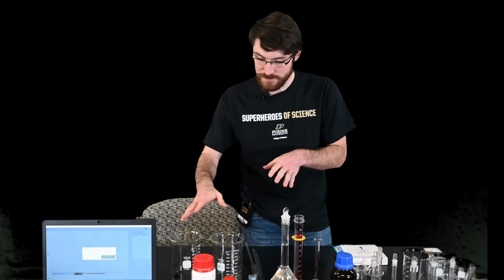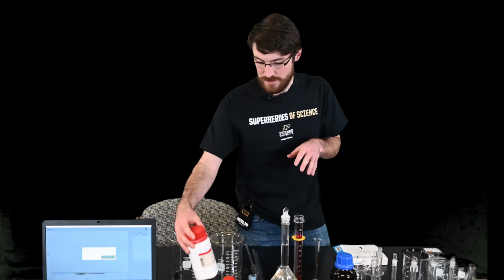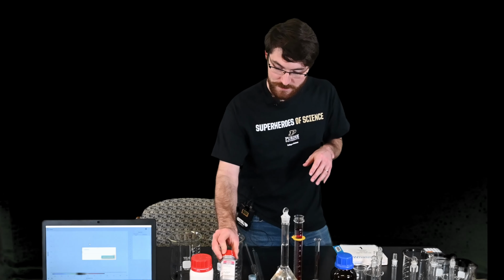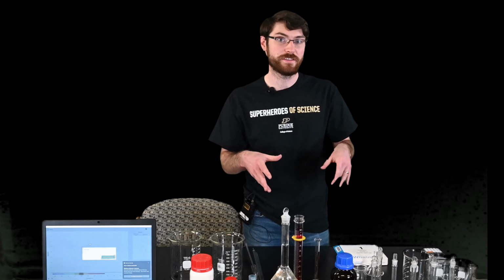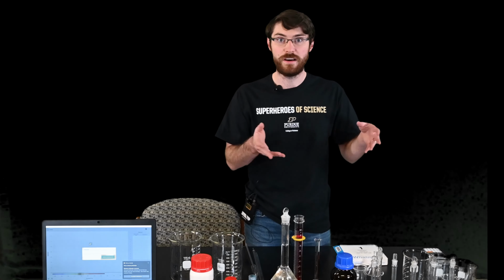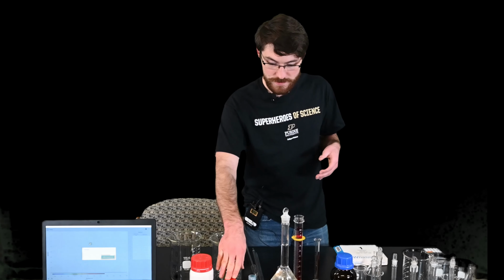Then we have our chemicals that we will need. We're going to need sodium acetate, that's going to be our buffer. Hydroxylamine hydrochloride, this will act as a reducing agent. So iron in water samples is commonly iron 3 and iron 2. We want to convert everything to an iron 2 plus or ferrous state. So that's what the hydroxylamine is for.